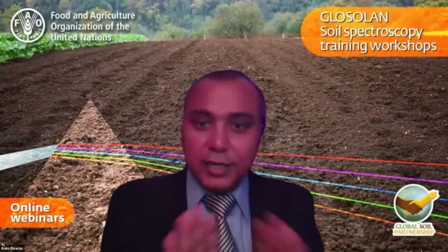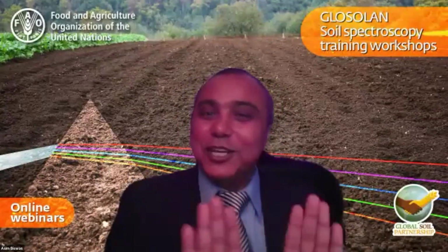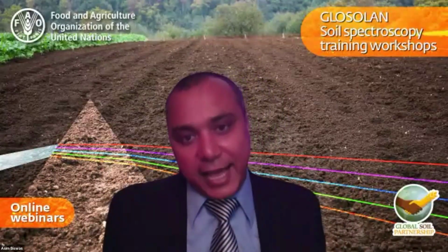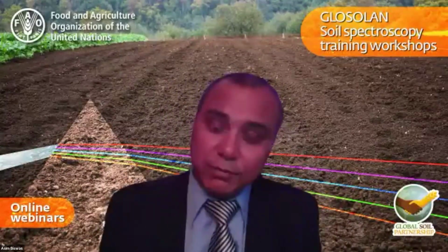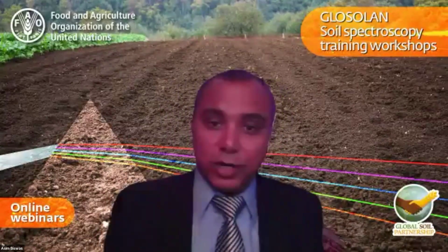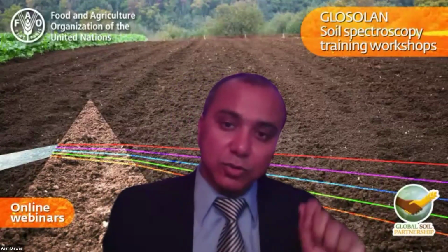Now we are really creating that apples to apples comparison, but how will that orange look like an apple? We are reshaping that so that we can bring it together and develop the model. So again, the modeling approach, what we're talking about, remains the same. But before modeling, we want to tune that field collected spectra, or in situ collected spectra, to come as close to my dry spectral condition as well.